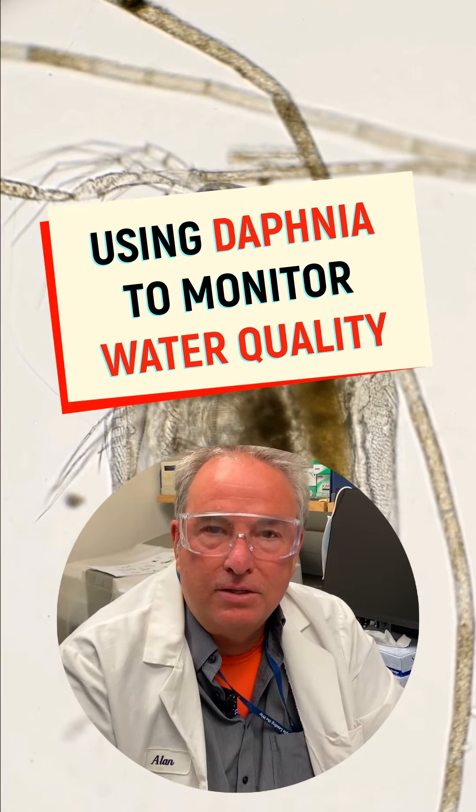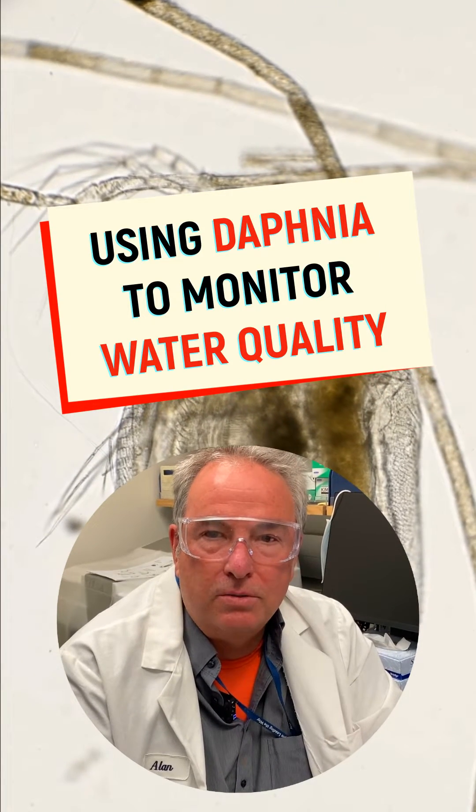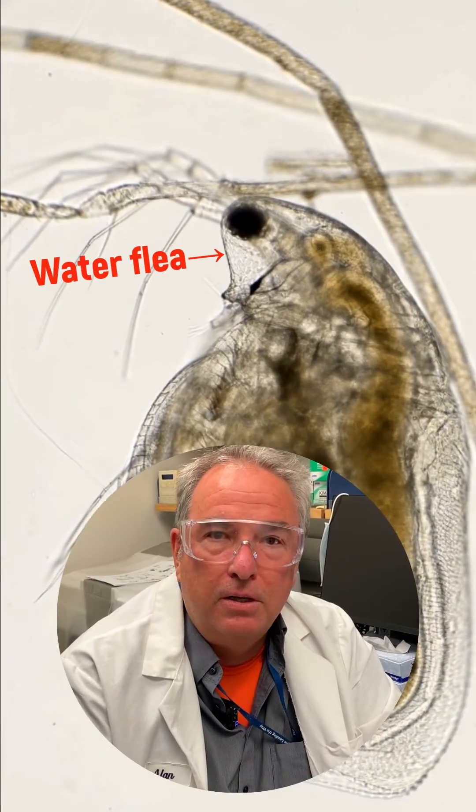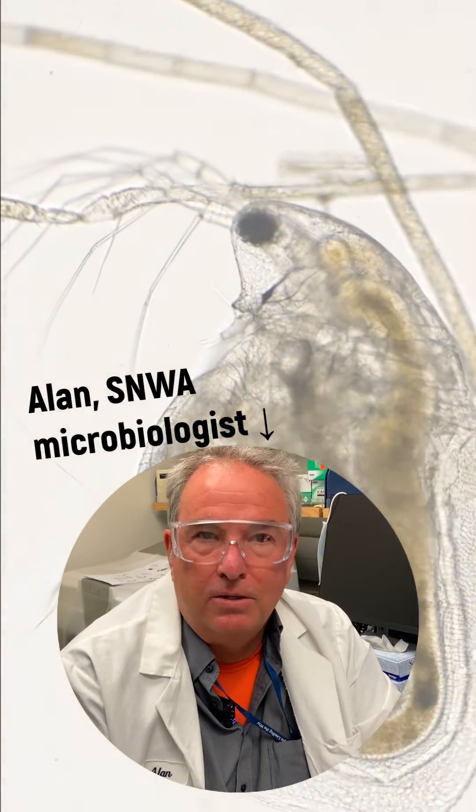Today we're talking about a unique analysis that uses an organism known as Daphnia magna, or what people may know as water fleas, to test for potential contamination of water.